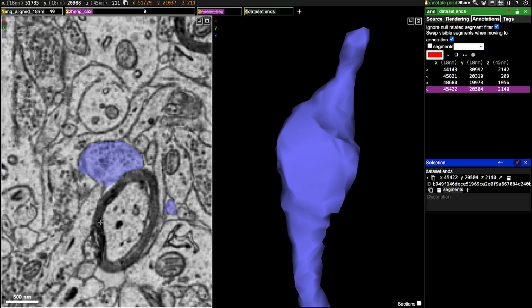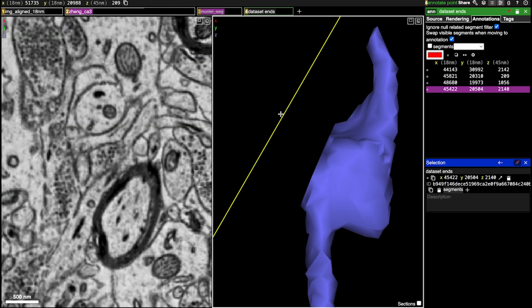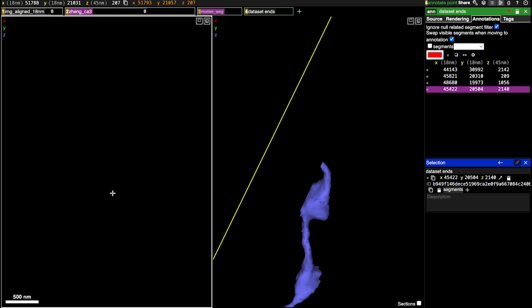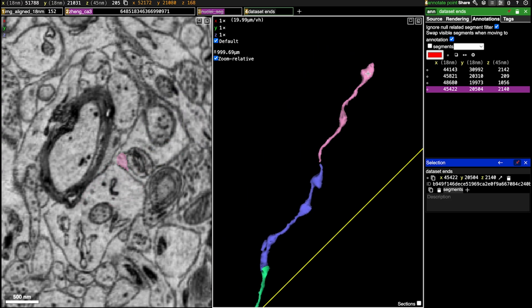Let's check here. Okay, looks like there's a little piece missing, but we can't click into it, so that's fine. Let's go to the end. Okay, and so we've got a bit of a black gap here, but we can see this one kind of coming across and can follow this little black dot. That's a good indicator sometimes for something to keep an eye on. You can see it right there. Okay, so there's the extension.